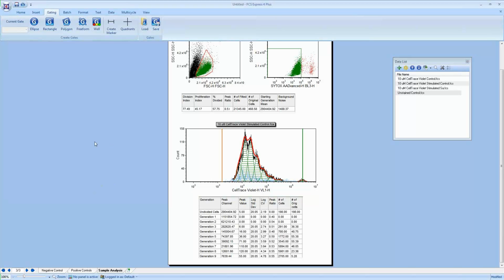So we've covered a lot in the last 20 minutes here. I just wanted to pause. Are there any questions that anybody has for anything that you've seen so far? We've pretty much gone through how to create statistics. We've gone through what the different fit parameters mean, how to insert or use tokens to define starting and background generation. So it's a lot to take in a short amount of time. And I don't see any questions coming in, so we'll just continue on.